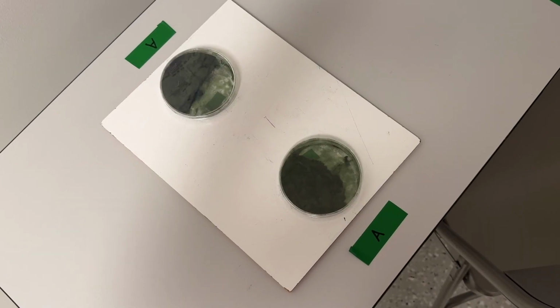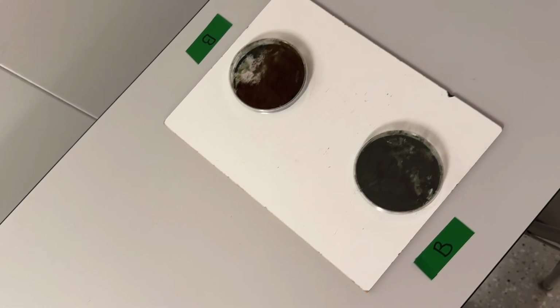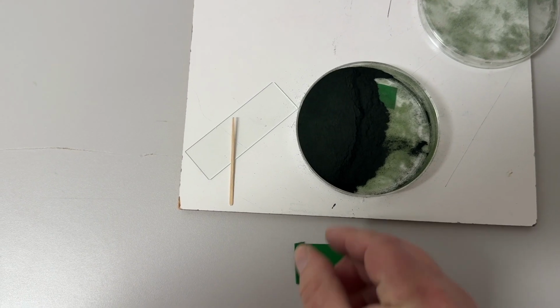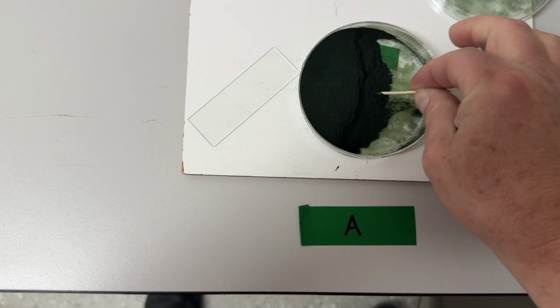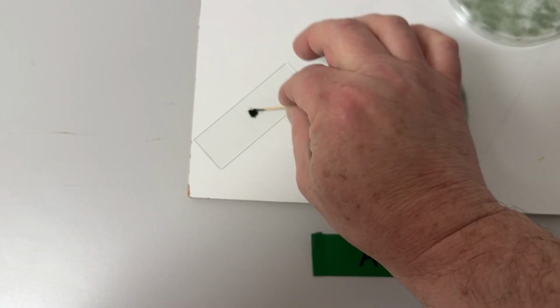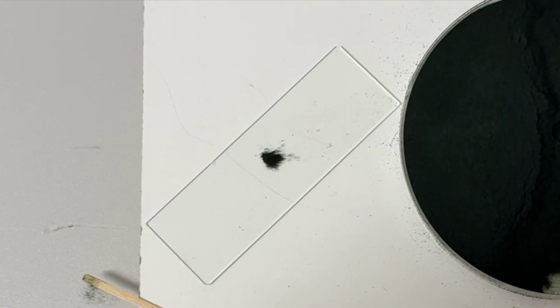The subjects you're going to be using to demonstrate this mastery will include 3 samples, all of them green powders, one labeled sample A, one labeled sample B, and one labeled sample C. To begin, you're going to want to take a very microscopic amount of one of the samples and place it on a microscope slide.